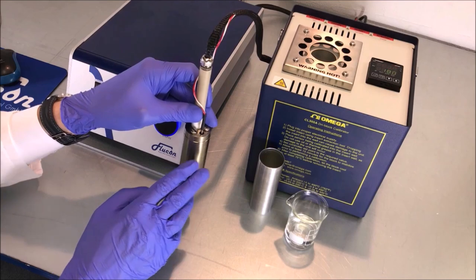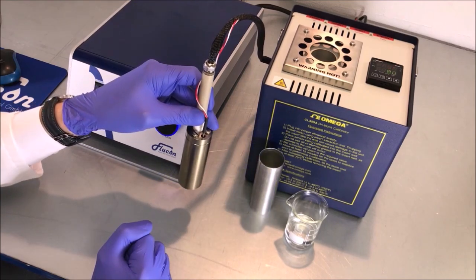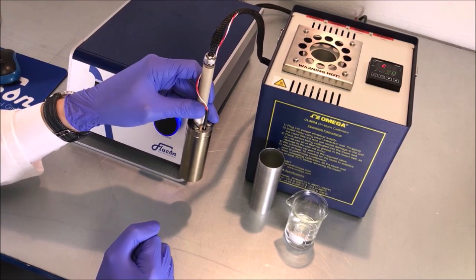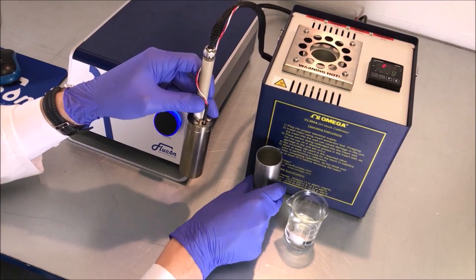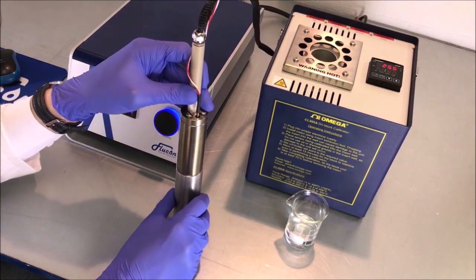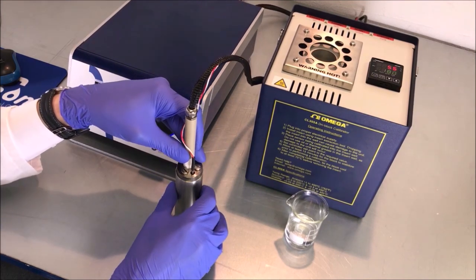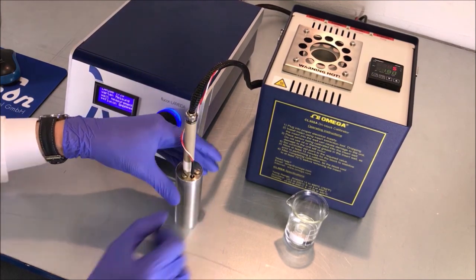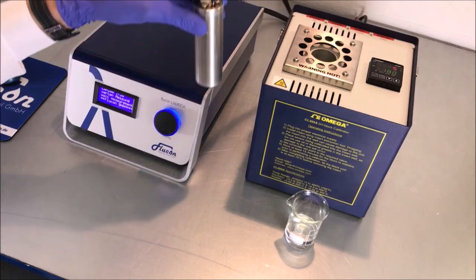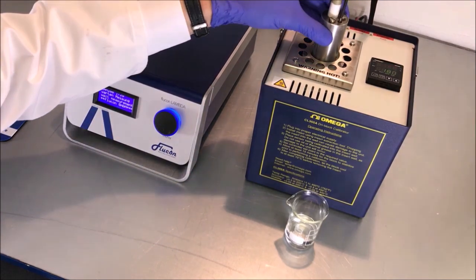Once the cup is screwed on tightly, mount the adapter sleeve which adapts to the inner diameter of the thermostat socket. You may now immerse the sensor into the thermostat.